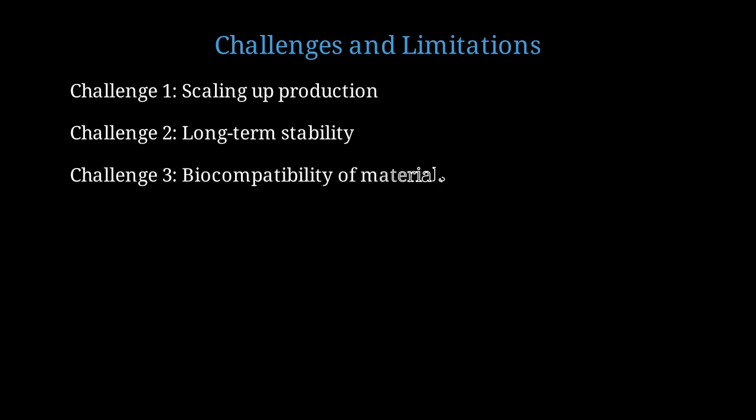Challenge 3 is biocompatibility. Many surfactants and materials used in microfluidics are toxic to cells, limiting biomedical applications. Challenge 4 is cost. Microfluidic devices, especially those made with soft lithography using cleanroom facilities, are expensive to produce and require specialized expertise.